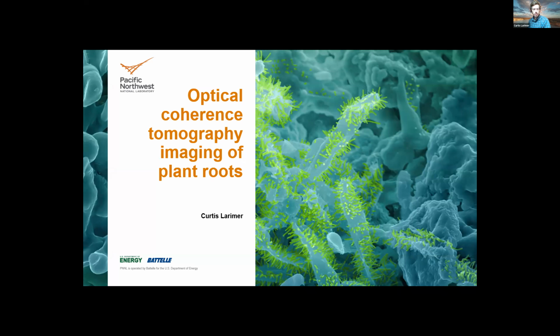I'm Curtis Larimer. I'm a material scientist. What I'm going to talk about in the next few minutes is just a relatively straightforward non-destructive imaging capability that we have, and that would be available to you all. It is an optical coherence tomography instrument.